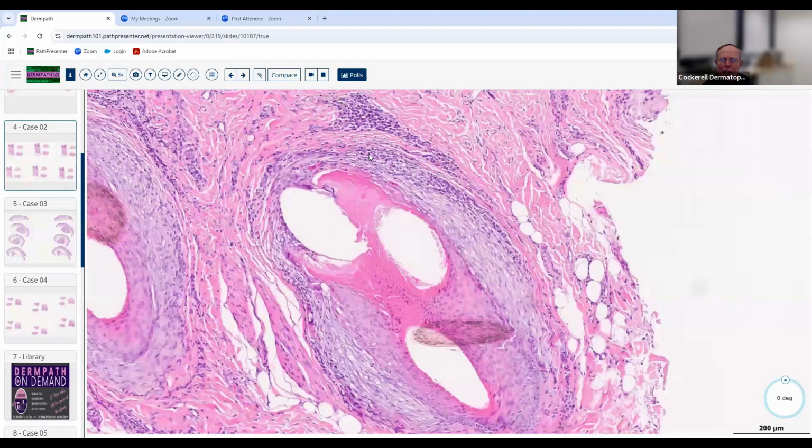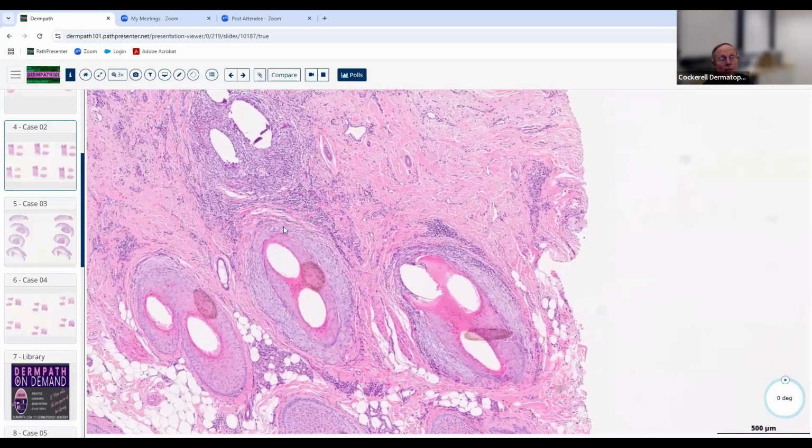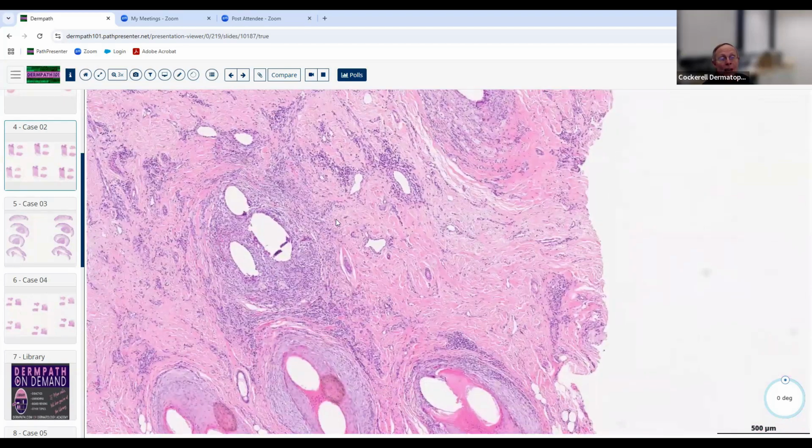It's an onion skin perifollicular fibrosis occurring at the level of the infundibulum and the isthmus where the stem cells live. And once you destroy those cells, it's over. Game over. You're never going to reverse this. So that's why if somebody's got Lichen Planopilaris in an early stage, you want to be super aggressive with them. Give them high dose steroids, give whatever you can to decrease that inflammation, because you really don't want it to get to this stage, because once it gets to that stage, you cannot reverse that. So that's why you want to really try to get it fast.